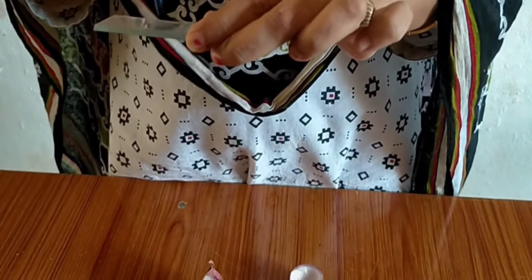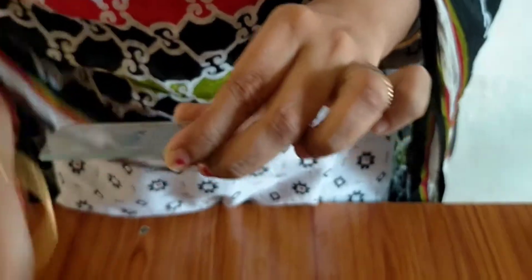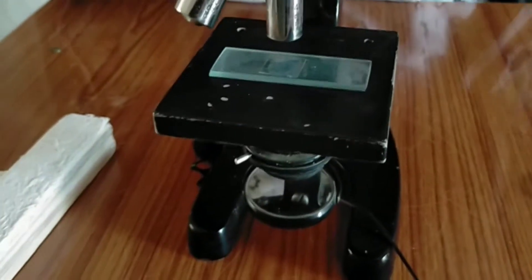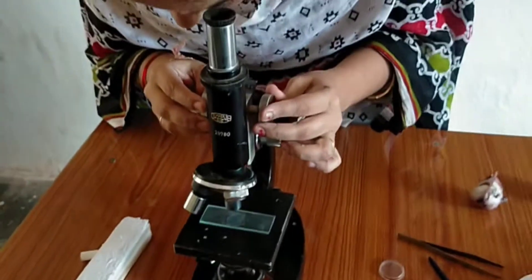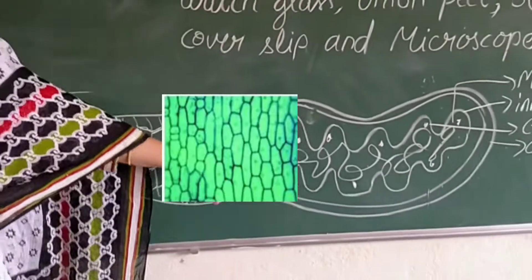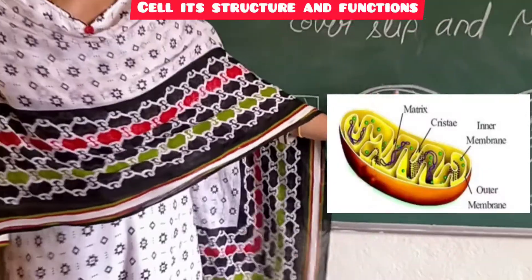So that we can see the cells of the onion peel clearly under the microscope. Our slide is ready. Let us observe the cells by keeping this slide on the stage of the microscope. We should note our observations. We can observe the onion peel cells with small dark spots on them, which are called mitochondria.